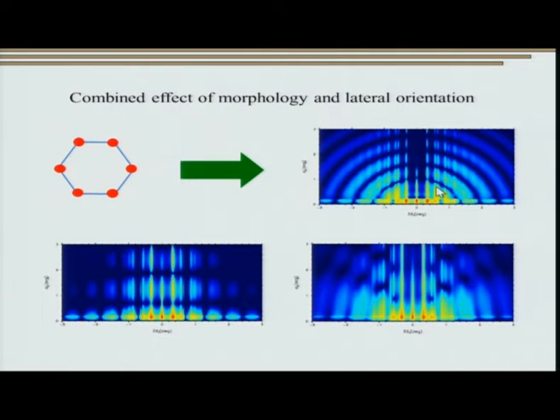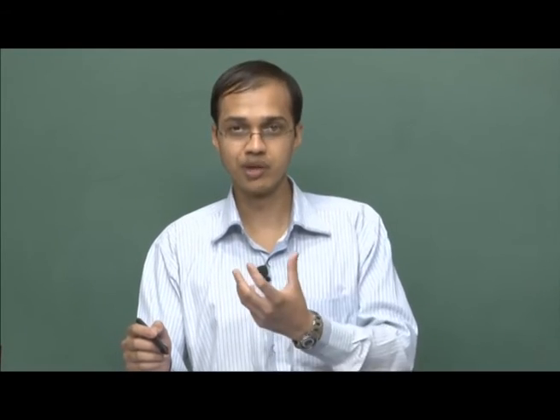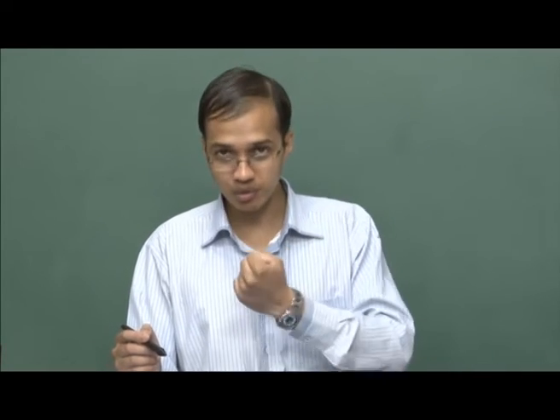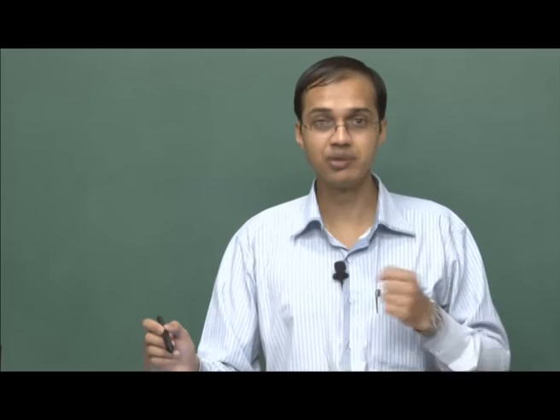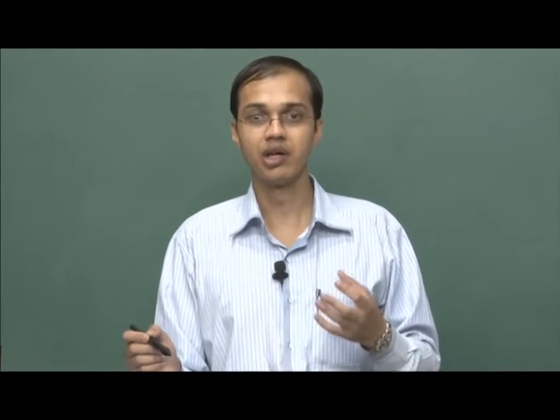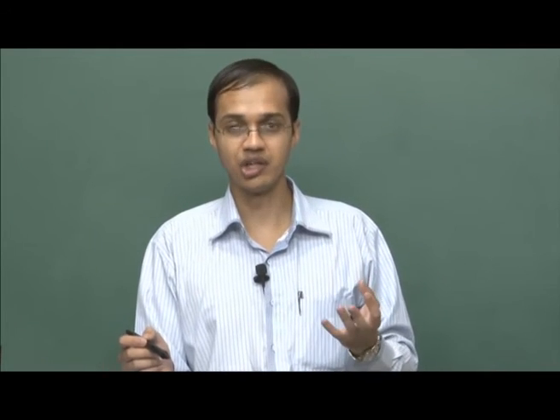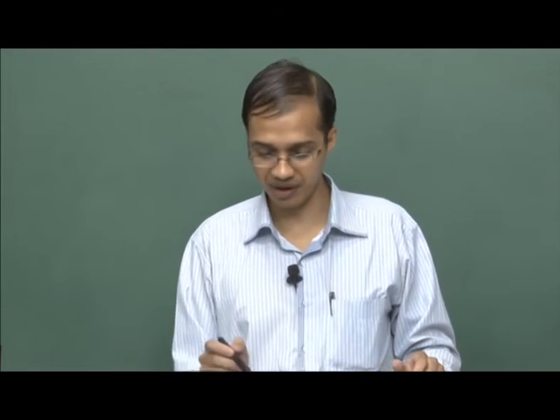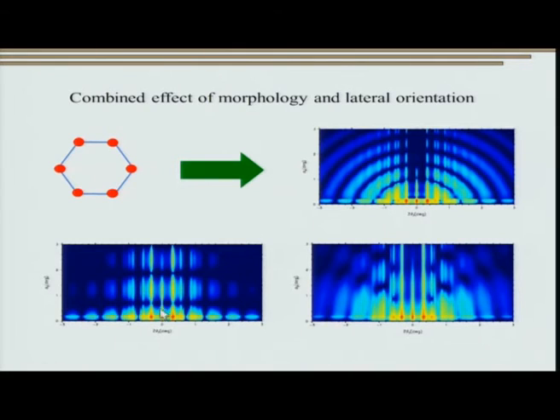Now, this form factor, I hope you appreciate that once you get your experimental pattern, what we need to do is assume shapes or make a first guess, do simulations and get a good match between the experimental and simulated pattern to comment something about the size and shape of the particle. For similar patterns, can we try to guess what exactly we are getting? I hope you appreciate that we are getting the same period, so this has to be all hexagonal.